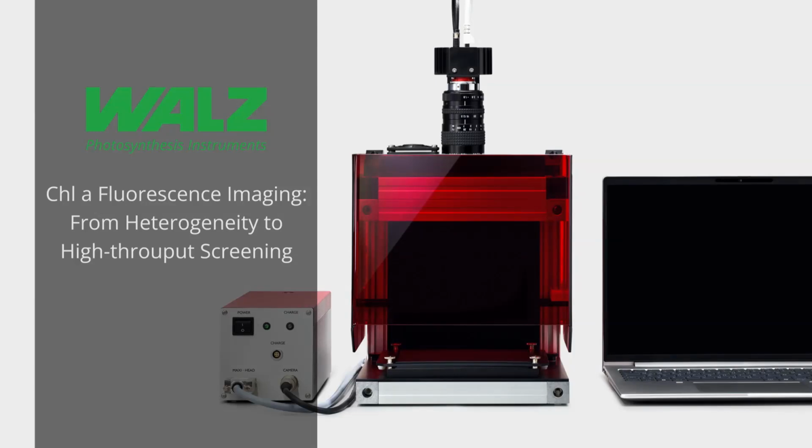This tutorial introduces the HEXAGON-IMAGING-PAM and places it within the broader context of our Walz imaging-PAM family. The topics presented here highlight selected and typical applications. For a complete and detailed description of all instrument functions, please refer to the manuals available on the Walz website.